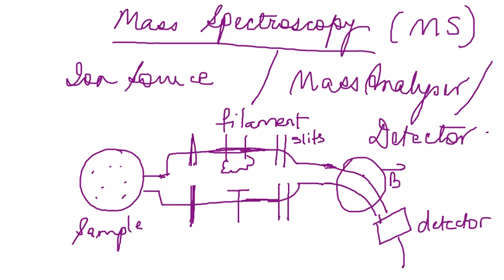We basically have a sample and we maintain it at a low pressure. Let's say the low pressure would be somewhere around 10 to the -2 torr or something like that. So pretty low. Atmospheric pressure, as you know, is 760 torr. 1 torr is 1 millimeter mercury.